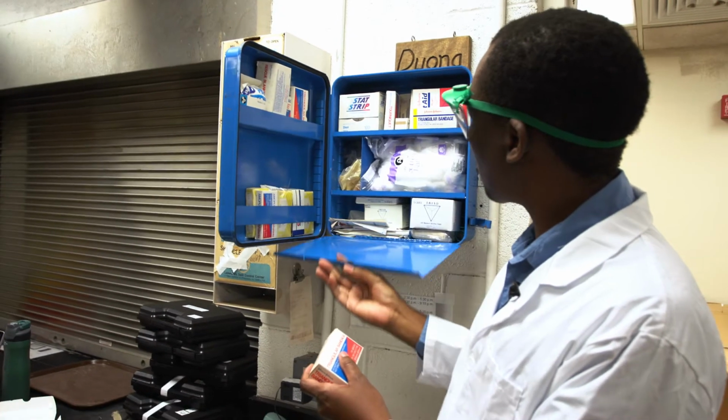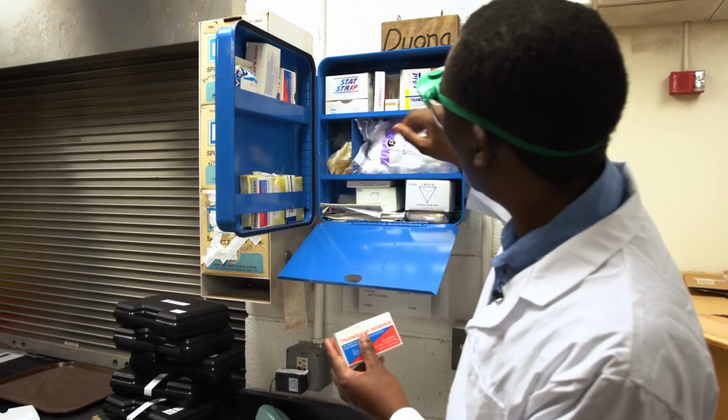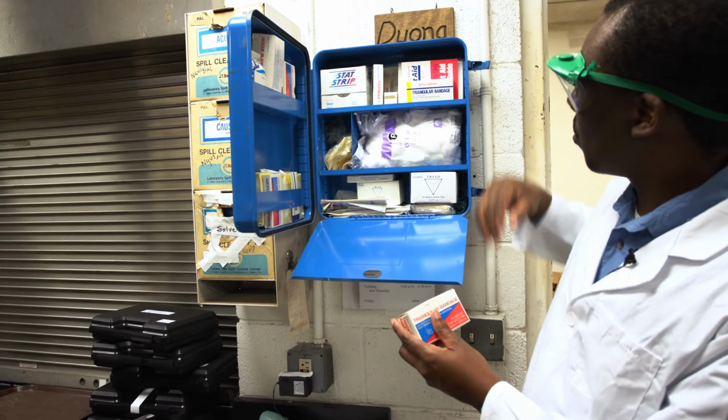If you are ill, please let your instructor know, because we do not think you will work safely feeling sick. And if during the lab you get injured, we would like you to report that injury. We do have a first aid kit here in the laboratory that we can use for minor cuts and such.